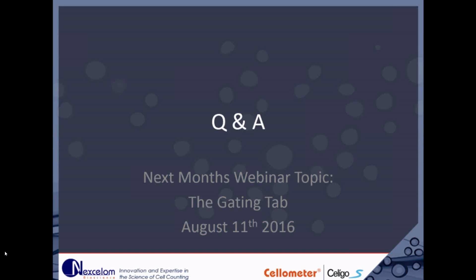That's also the reason I showed the slide in the beginning about how those algorithms work, to give you a mind's eye of what's going on in those images. So the fluorescence does work for those suspension cells. Absolutely, because of the way the software is looking to detect what it's going to identify as a cell. Exactly. Yep.